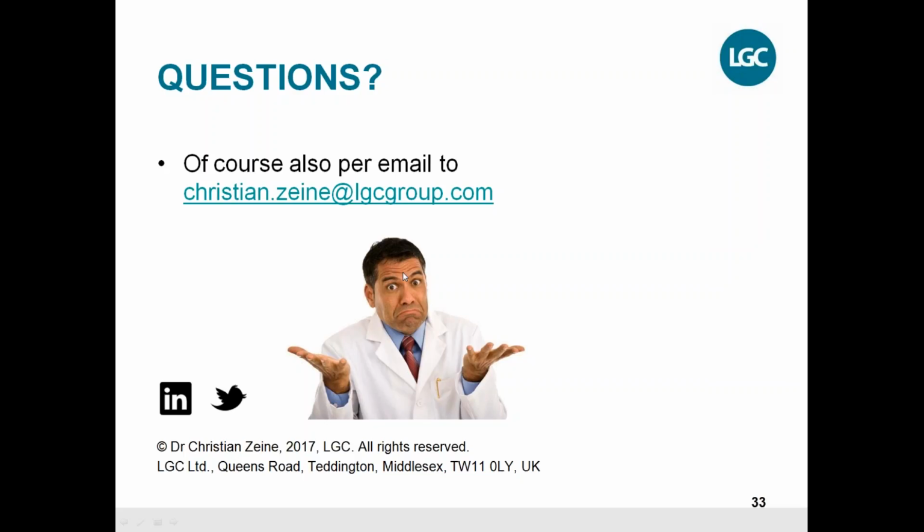For an internal standard, when you use it as a quantitative standard, where you compare the peak areas to the internal standard, that is a little bit different. I would try really to check that during the validation studies, if you have the right recovery rates, and then you would have kind of validated that use for this material as well. But normally it does not work. You would normally get results that you wouldn't expect during such a validation study. Yeah.